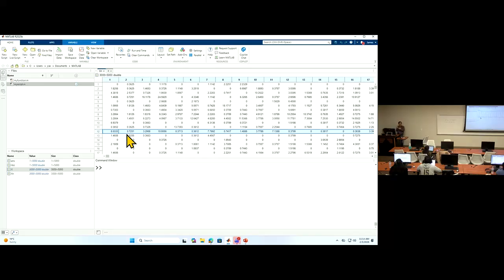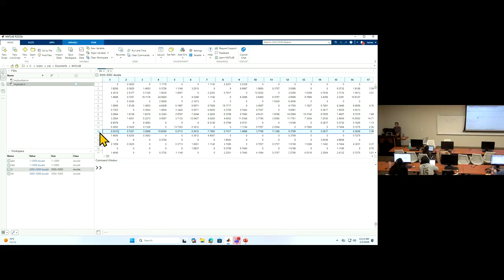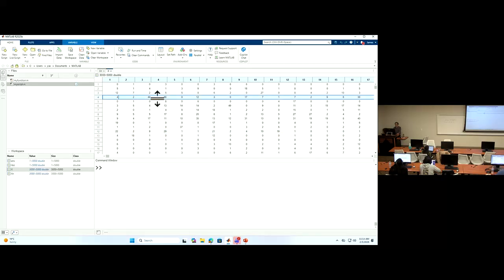Through normalization, I just made every column have the same summation, the same total. That's all it changed. So the gene numbers may change, but the overall pattern should be kept. So the number 12 gene is still highly variable, highly expressed. Number 4 gene, in my cell number 4 is 66, a really high number.